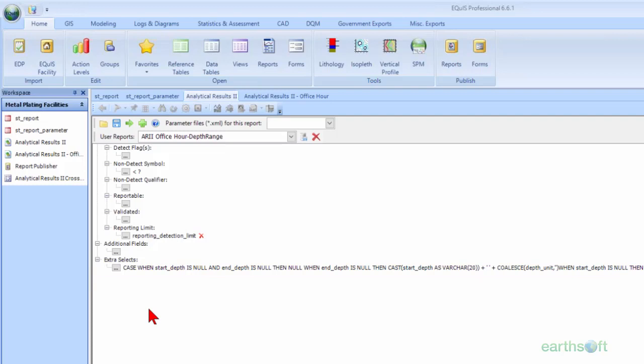But you might decide, look, I want to make sure this is in there all the time. My users are not necessarily so savvy that they are going to be able to add an extra select statement correctly without any sort of syntax errors. You will, of course, get an error if you run the report without the correct information. And because of that, you might say, I want to be able to make this a default value that's hidden.